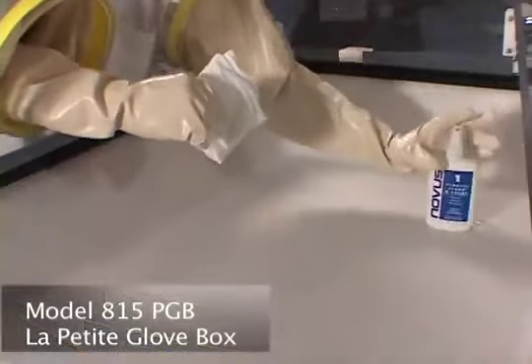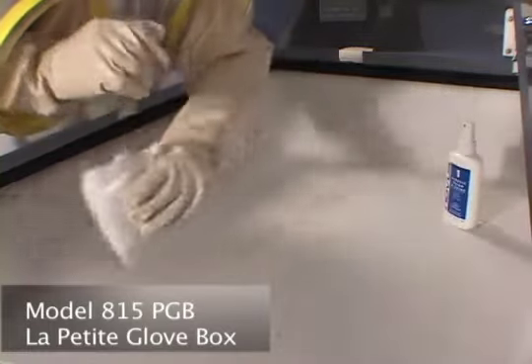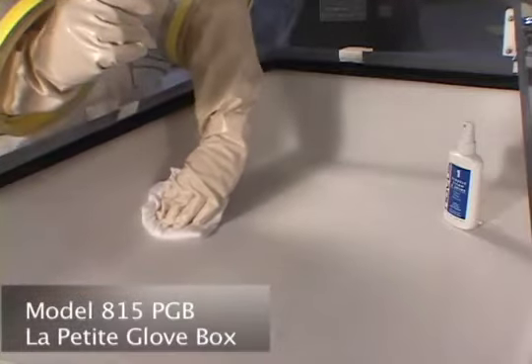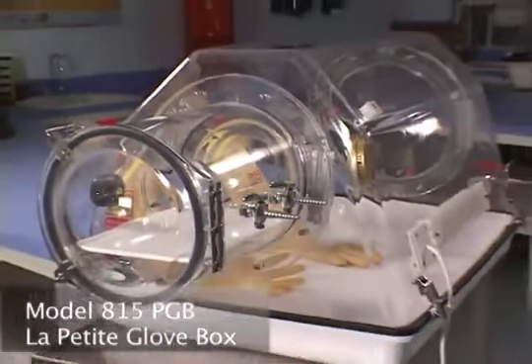The 815PGB has been designed to be ergonomically correct for the average person. This lightweight box is easy to carry from lab to lab and features easy to clean rounded corners. Careful attention to research requirements makes this glove box very user friendly.